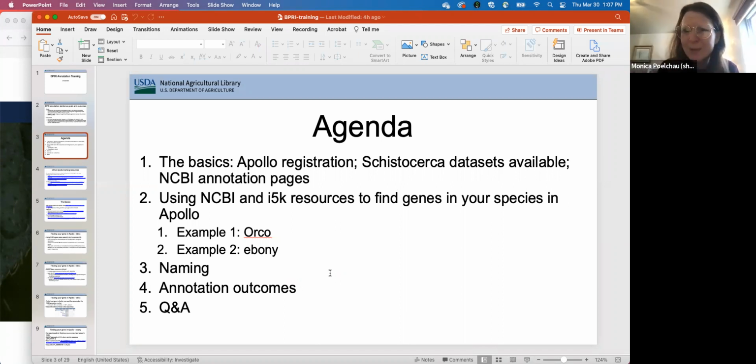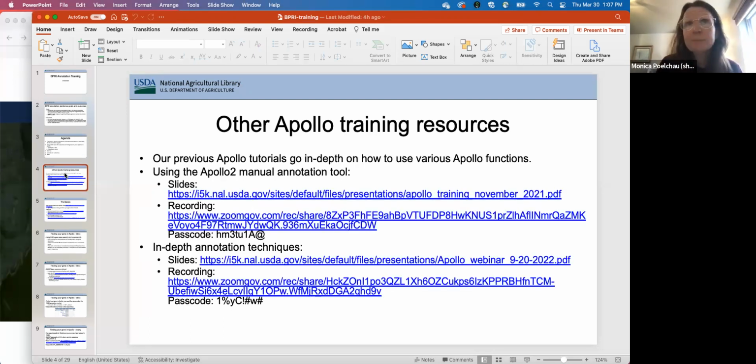So I'm hoping I'm going to cover many of the gaps that you might have that are not defined in the other webinars that I sent, the recordings that just go over how Apollo works and how to make a basic annotation, evaluate RNA-seq data, that kind of thing. But please, during this webinar or afterwards, whenever, just raise your hand and use the chat, so we can figure out where things are missing. And if need be, we can also set up another session.